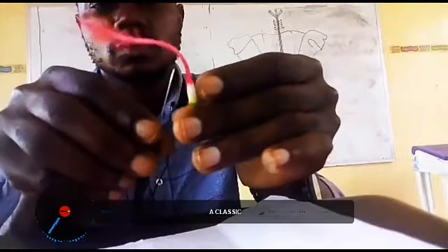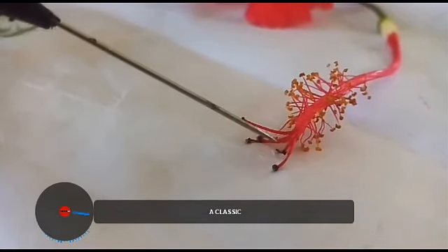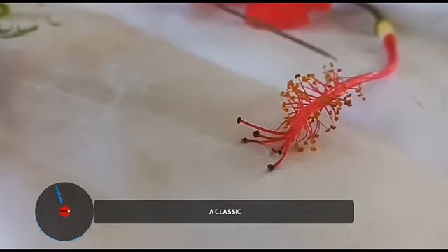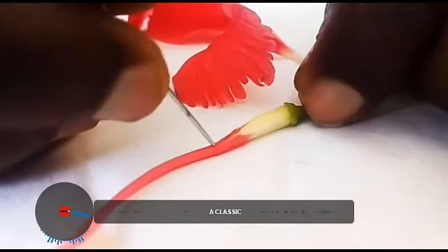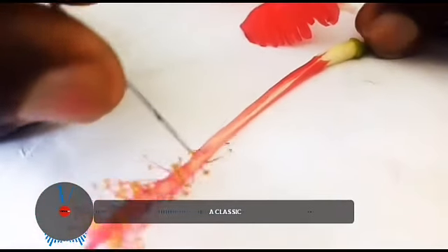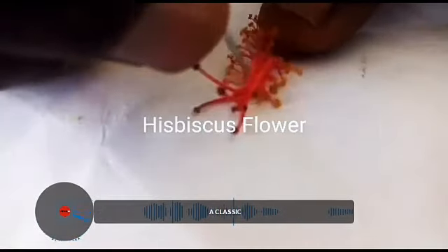So what we need to do now is the dissection of the region of the ovary. We have the stigma. There are 5 stigmas. Then you can see the anther bears the pollen grains. So we have a dissection through the region. We are dissecting through. You will definitely see what it contains inside. Good. A cut through it, you see the structure we have inside.